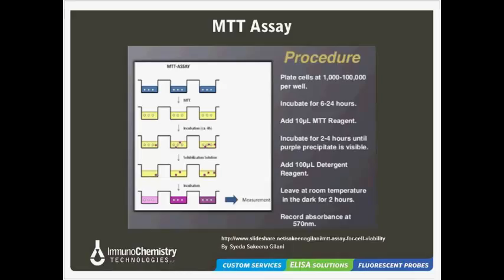This technique can determine the loss of viable cells and a reduction in proliferation. However, in some cases, an increase in proliferation may be offset by the amount of cell death, so you can't tell if anything's happened. These types of release assays suffer from high spontaneous release of the tracker dye from both the target cells and sometimes the effector cells. They may generate false positives or high background if the target and effector cells release the same component like LDH. And these assays can't identify target cells nor distinguish apoptosis from necrosis.